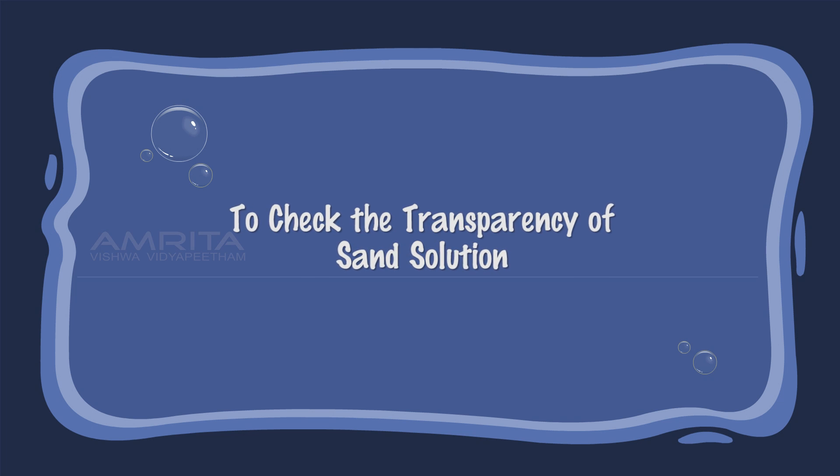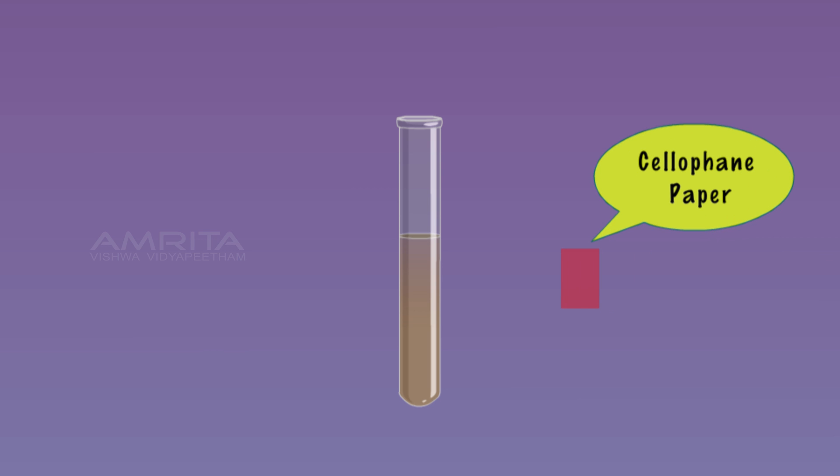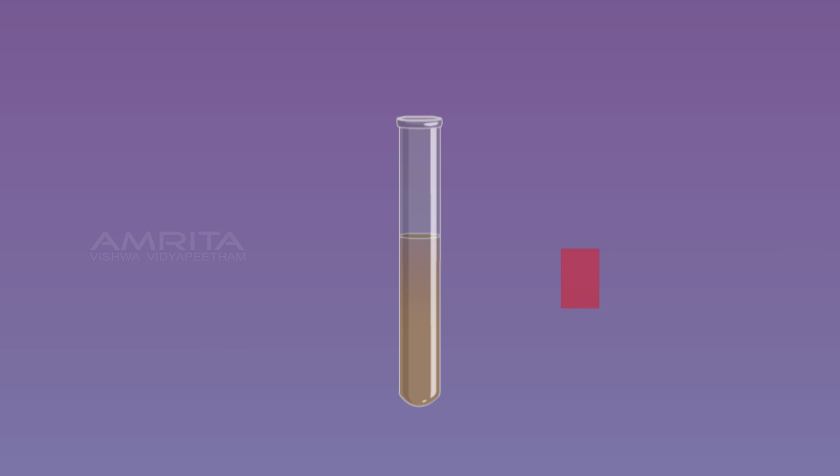To check the transparency of the sand suspension, take some of the sand suspension in a test tube. Paste a small strip of cellophane paper on one side of the test tube and view it from the other side. The cellophane paper is not visible from the other side, indicating that the suspension is opaque.